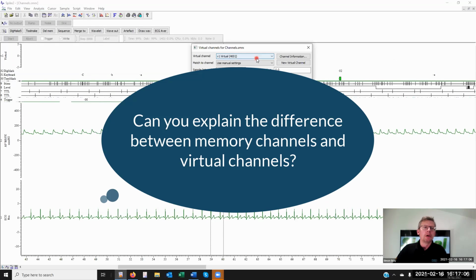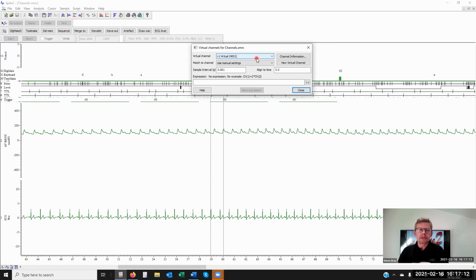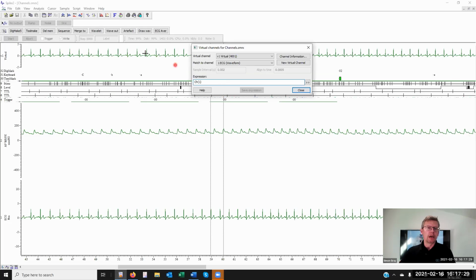Okay. Right, a virtual channel is a calculated channel. It doesn't live in memory as such. It is simply recalculated as the source data changes. So if I were to type in here, match channel 1, and I type in channel 1, there, I have a duplicate. Sample rate is the same, the data is the same.